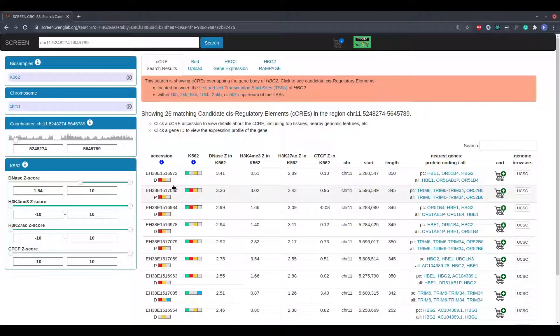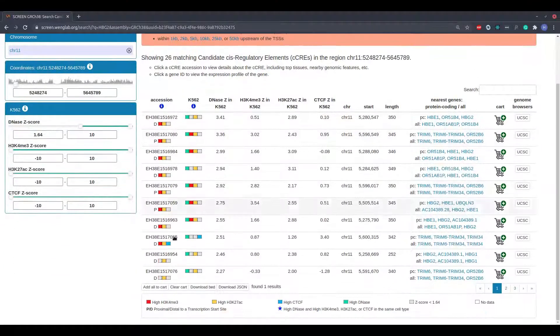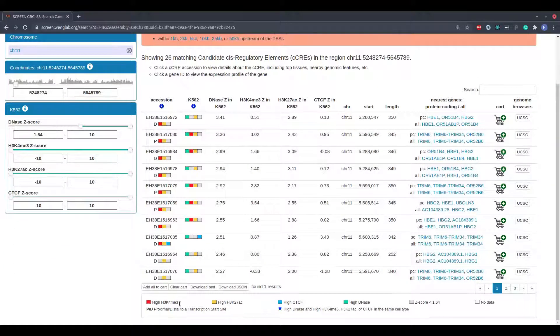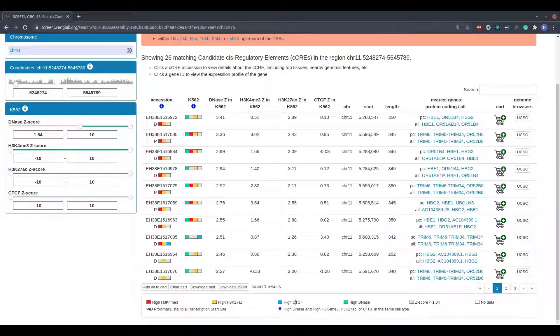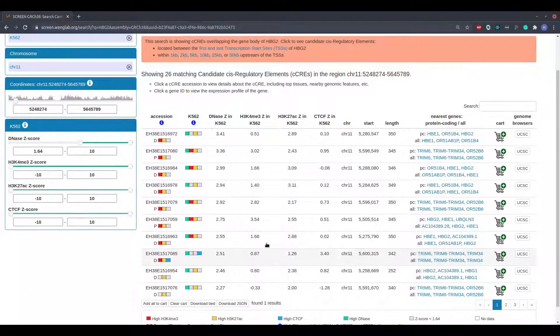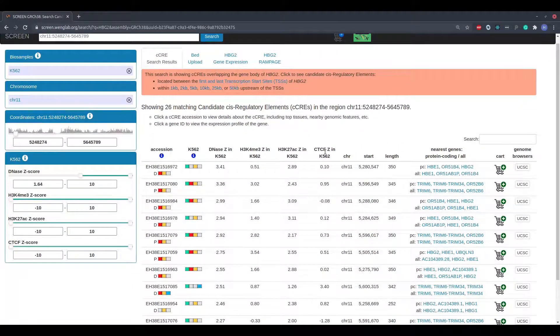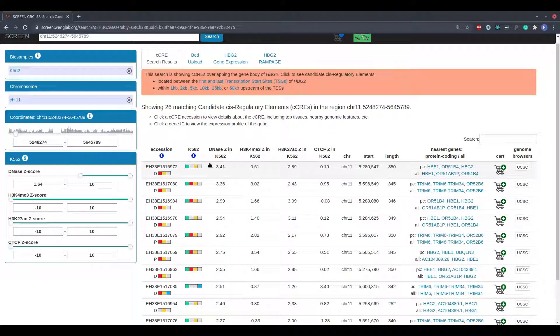The legend below the table shows which colors correspond to which marks. The next four columns show the Z-scores for the candidate regulatory elements across the four epigenomic marks.